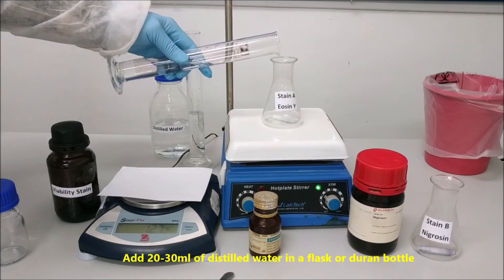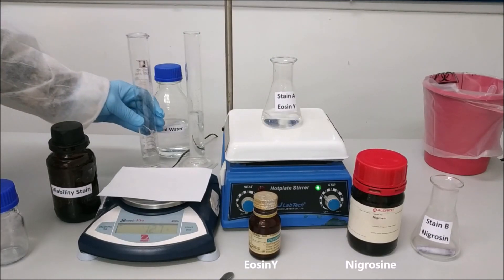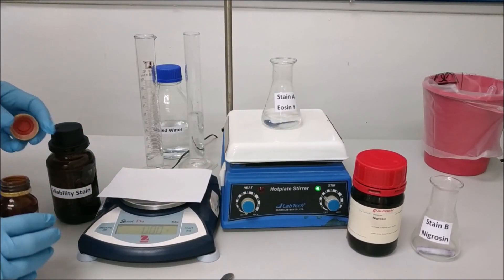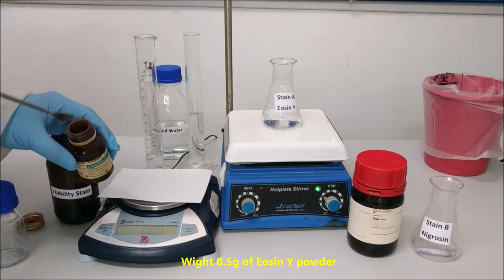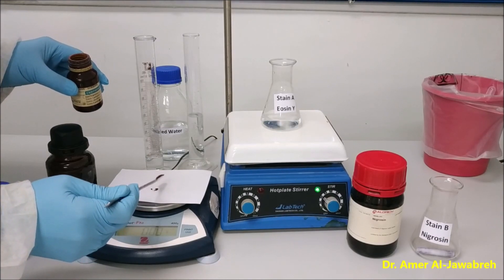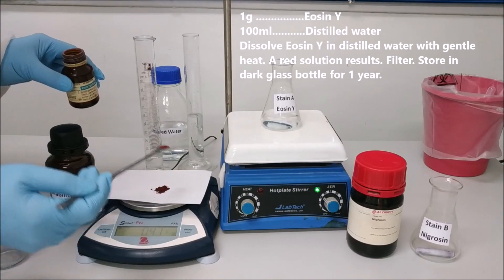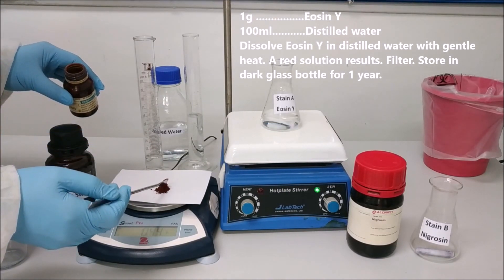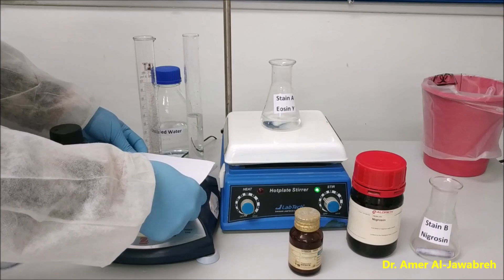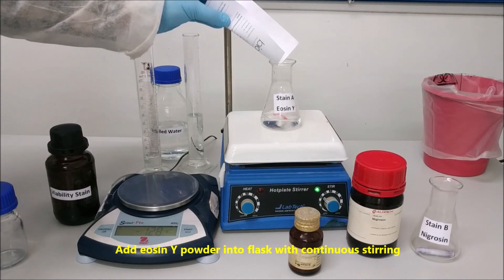Add 20-30 ml of distilled water in a flask or Duran bottle. Weigh 0.5 gram of Eosin Y powder. Add Eosin Y powder into the flask with continuous stirring.